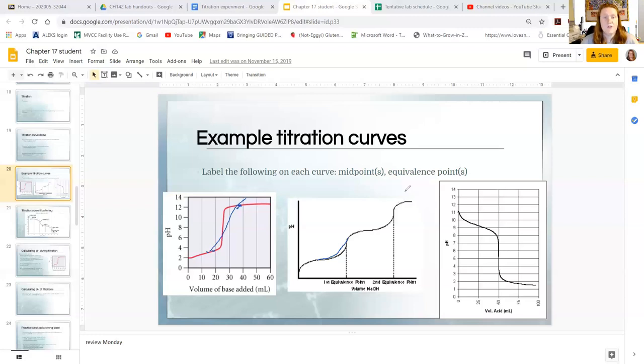You want to make sure to record in your lab notebook at what point the pink happens. So when you do your graph, you're going to write on here where the pink, the end point is what we call that. You're going to write on your graph where that occurs at, but we're going to go way past that in both cases. It's going to be like bright fuchsia up here. Okay. So that's the titration part of the experiment.